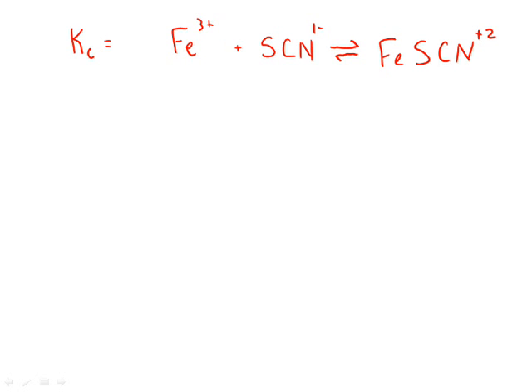Now, what you did last week was you prepared a series of solutions. Because this is red, we can use the colorimeter to measure concentration, right?